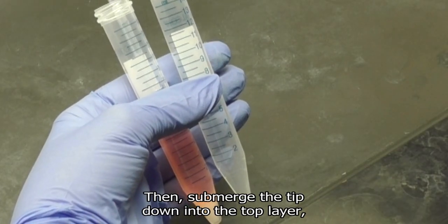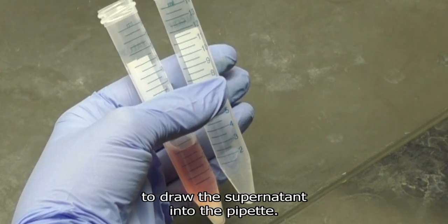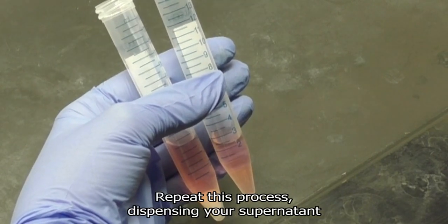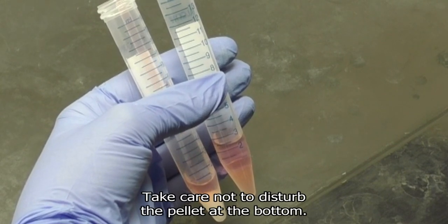Then submerge the tip down into the top layer and gently release pressure to draw the supernatant into the pipette. Repeat this process, dispensing your supernatant into a clean receiving vessel. Take care not to disturb the pellet at the bottom.